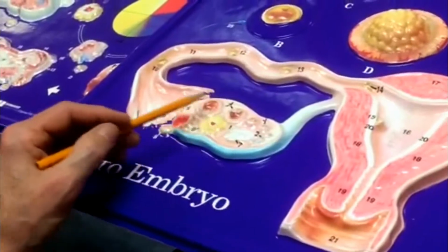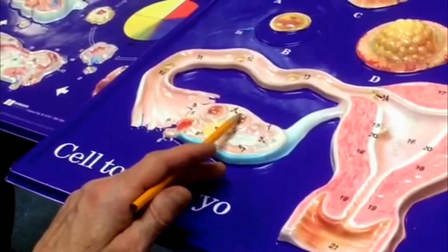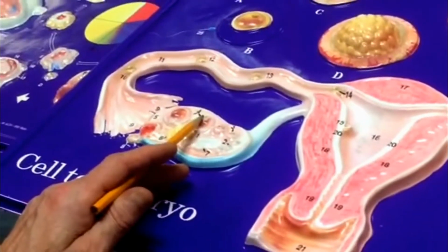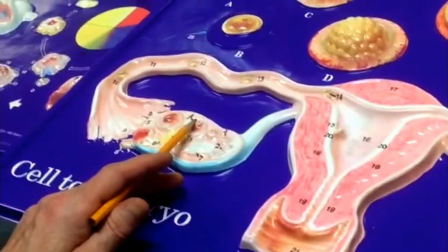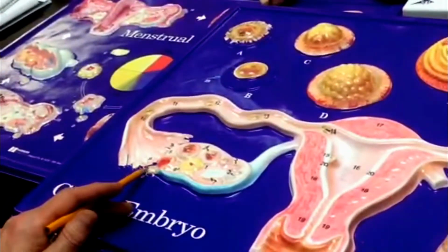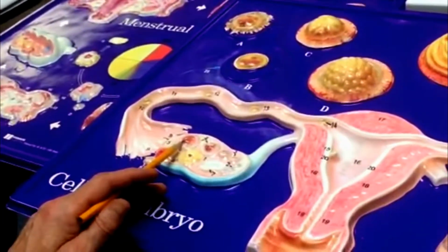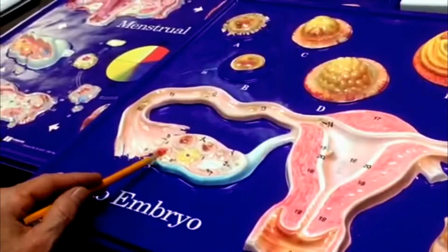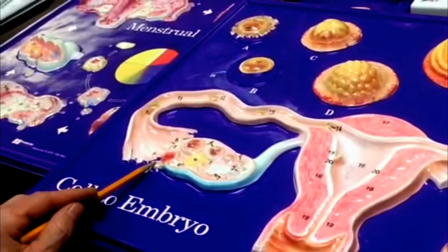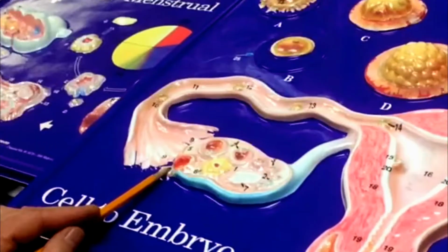Graafian follicles. In this one here, what kind of oocyte would have to be there in this earlier stage Graafian follicle? Still would have to be a primary oocyte. Here, we don't know how close it is to that, so this could be either primary or secondary. Here they're showing you the Graafian follicle ovulating, so this egg that just got spit out has to be a secondary oocyte.